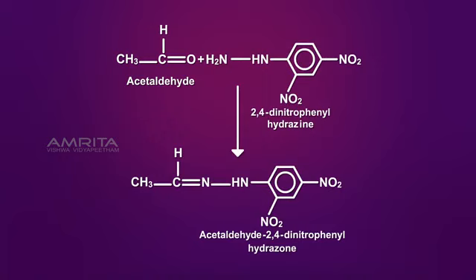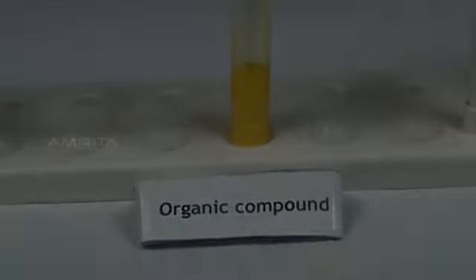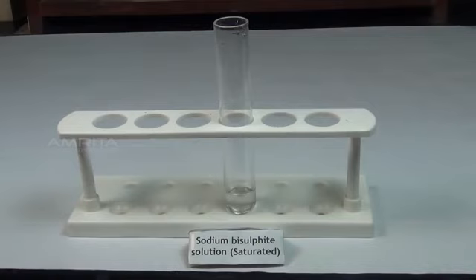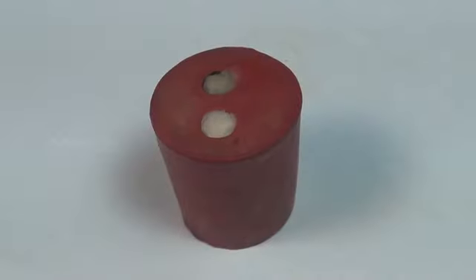2,4-dinitrophenylhydrazine reacts with the carbonyl group present in the aldehyde to form a yellow or orange precipitate of 2,4-dinitrophenylhydrazone. Sodium bisulfite test. Materials required: organic compound, saturated solution of sodium bisulfite, dropper and a cork.